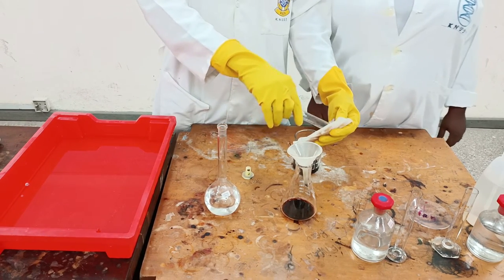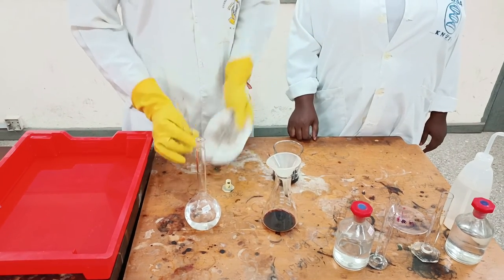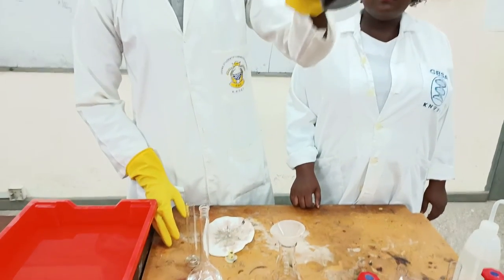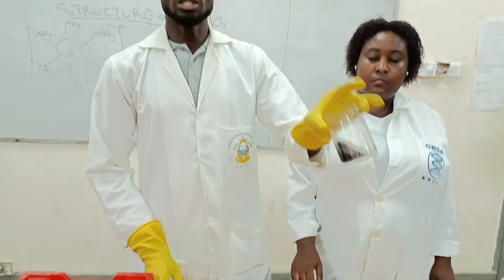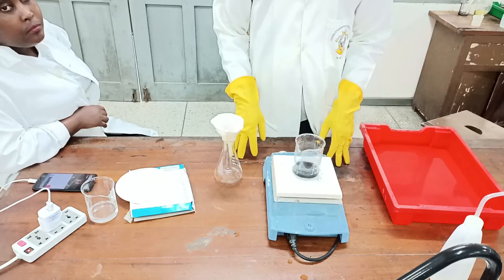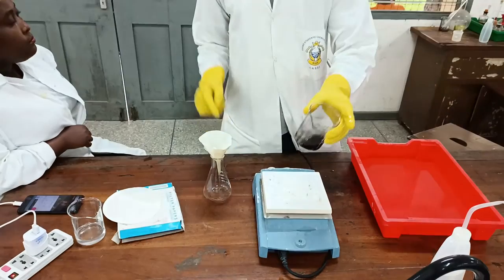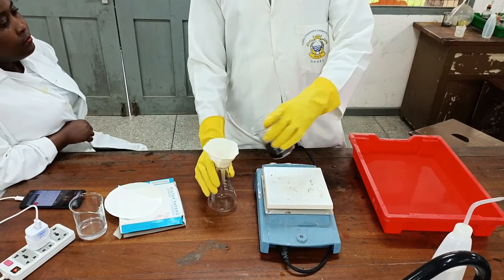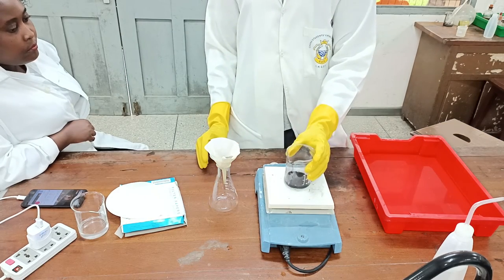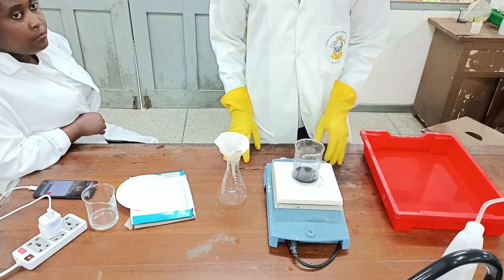We've washed our crystals together with the activated charcoal. Now we are going for heating so that the crystals will dissolve, leaving the activated charcoal. So we are doing the recrystallization, so we filter hot. We wet our filter paper, ready for filtration, gradually, so that nothing crystallizes on the filter paper.